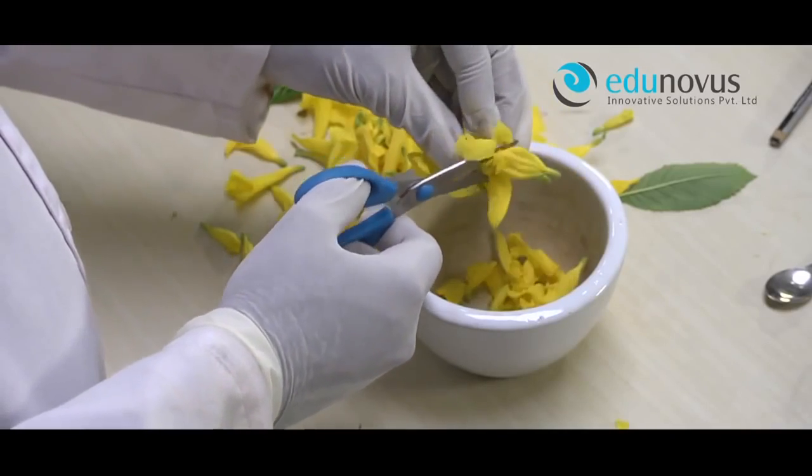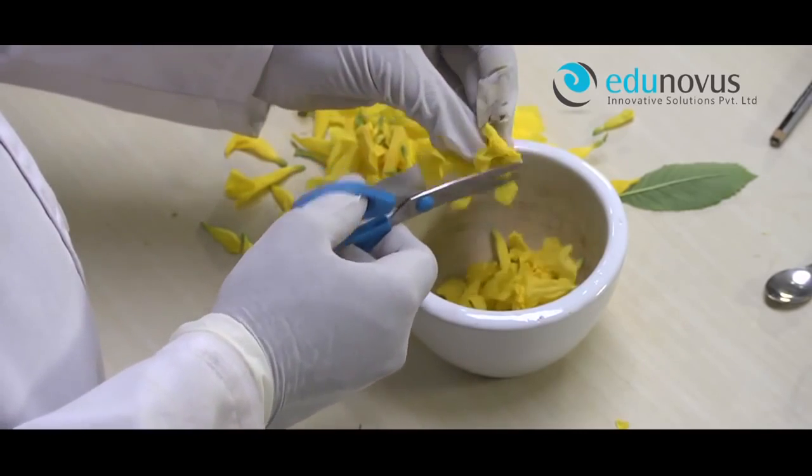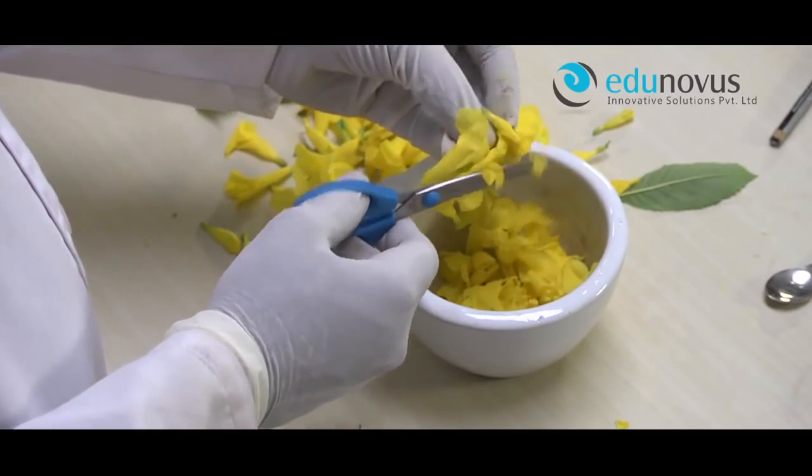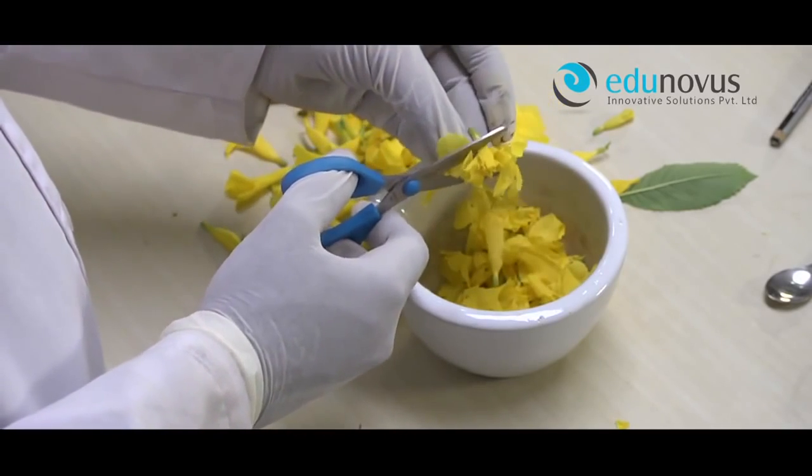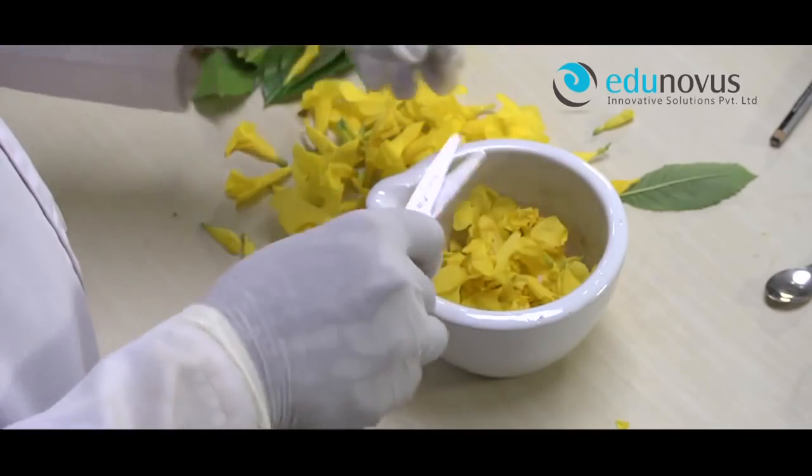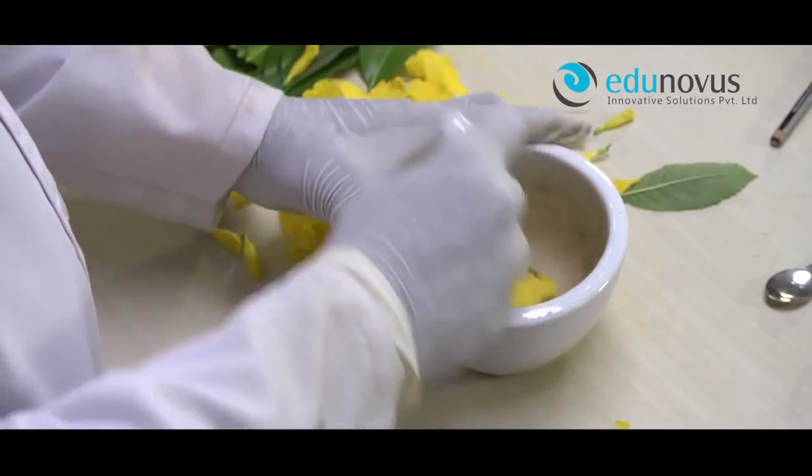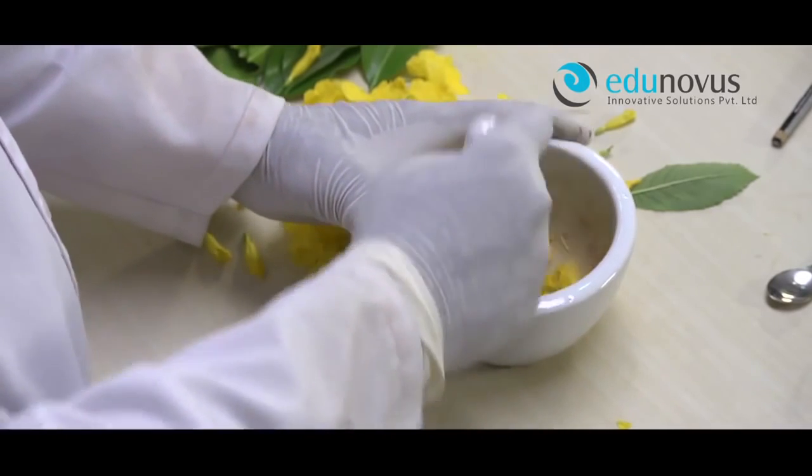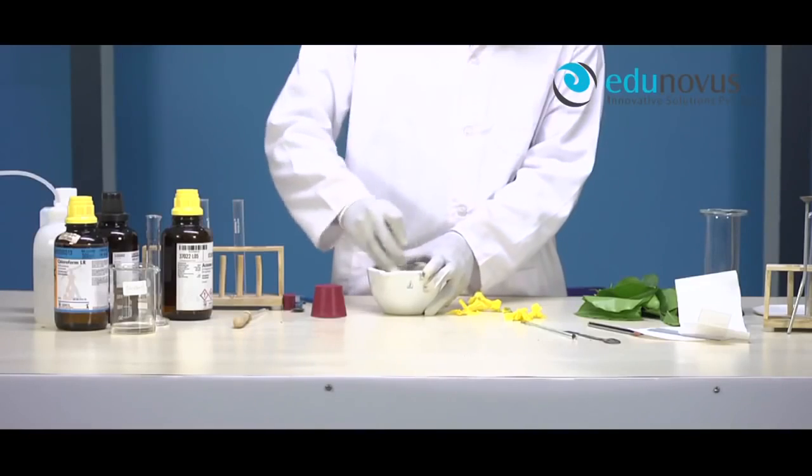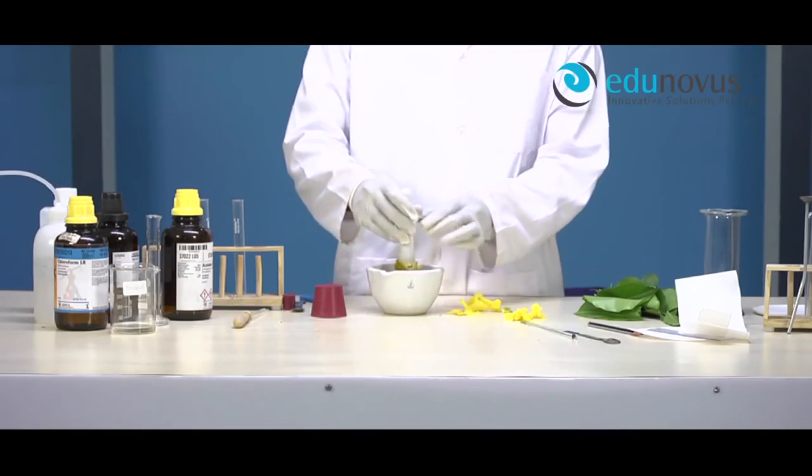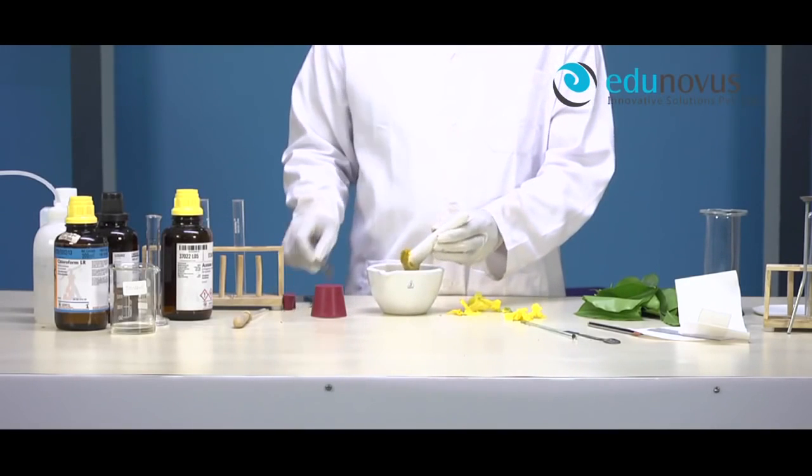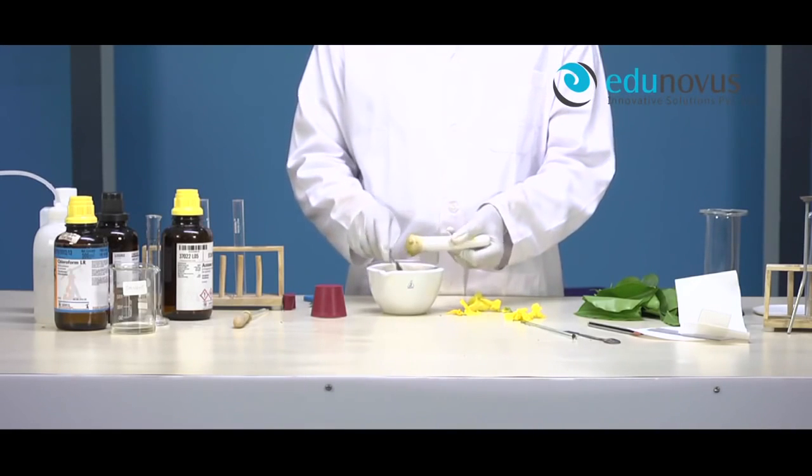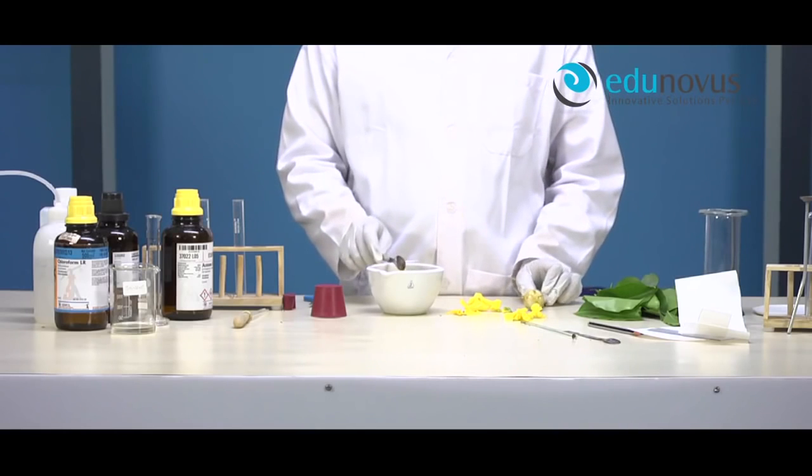First, chop the flowers into a mortar and crush them with the help of a pistil.